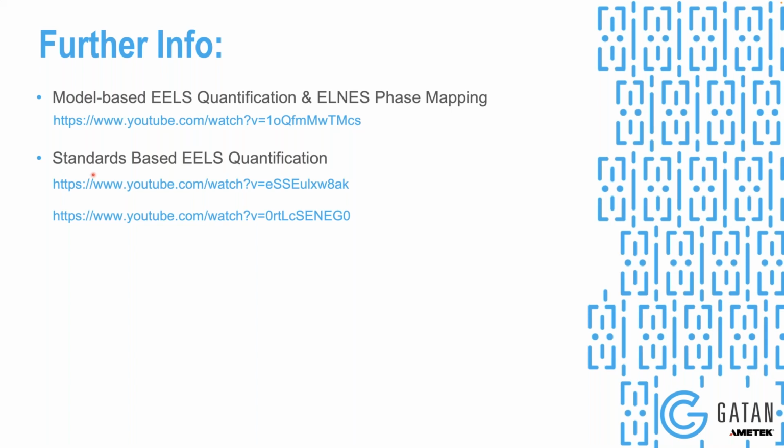I have some links for some people here in the questions, some papers that might be useful about low loss or extremely low dose EELS on polymer samples, which is another really nice example of what you can do with standards.